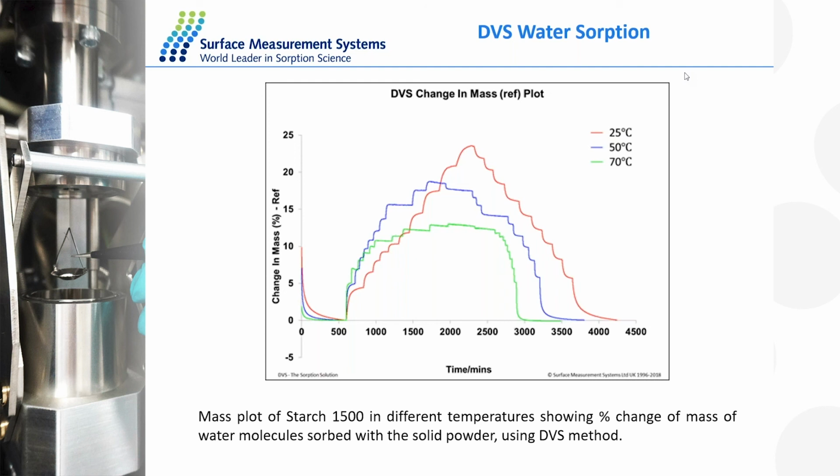Yeah, it's all to do with the reservoir and the head space. We have taken different measures to reduce that. One is by increasing the size of the bottle, and then increasing the volume of the liquid in the reservoir. But as you say, towards the higher end of the relative humidity generation, you see more of this effect. And of course, at higher temperatures, above 50 degrees, this effect is more.